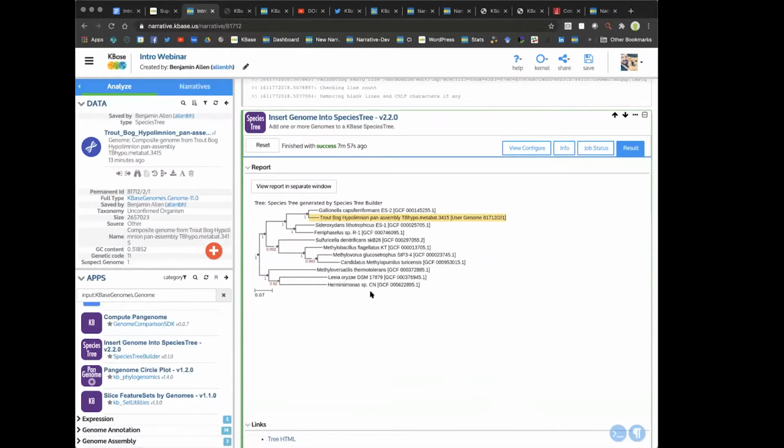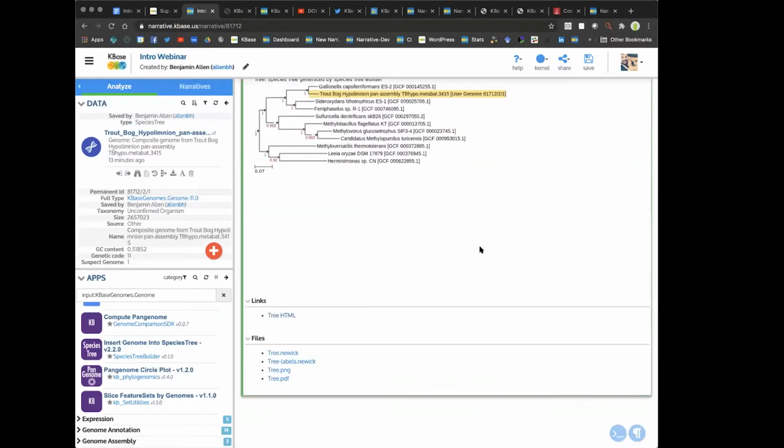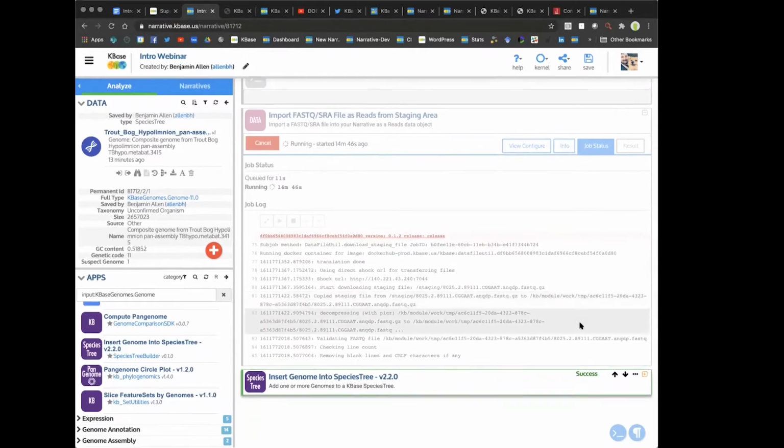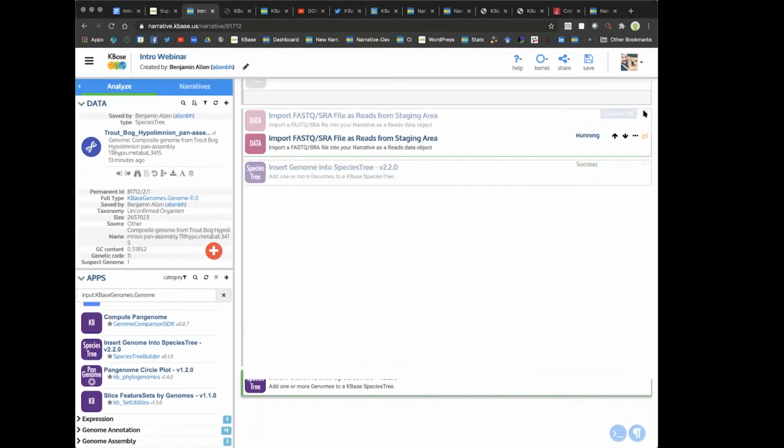Okay, I think I have covered the basics of the narrative. Oh, no, two more final things to show. So I've showed your data importer. It's still importing this data. It might take a little while.